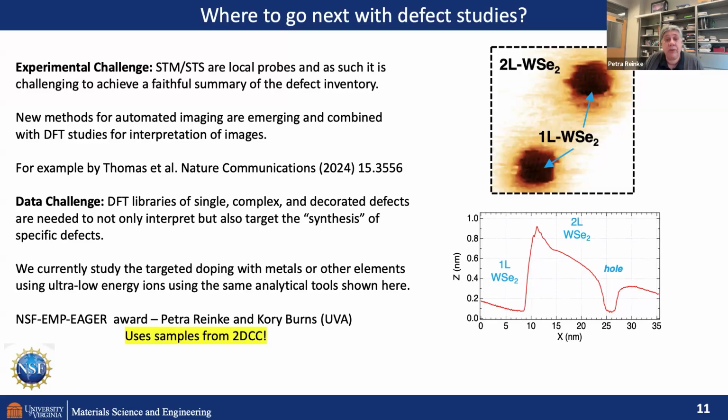Let me point out, we're right now doing something which is more crazy. We're trying to use low energy ion irradiation to be more targeted in the introduction of defects. And this work also benefits greatly from samples we're receiving from the 2DCC.